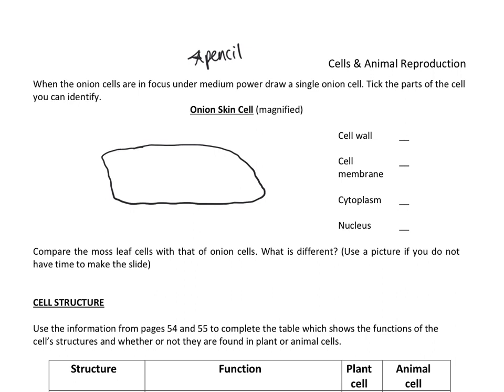So something like that, some sort of regular-ish shape, but you could see that some of the edges were a wee bit diagonal as they stacked with the other ones. And then you could see that the wall, it was thick. Well, you could see it two-dimensional as such. It wasn't just one thin line. We could see that it was a thicker line. And that's because plant cells have what we call a cell wall.